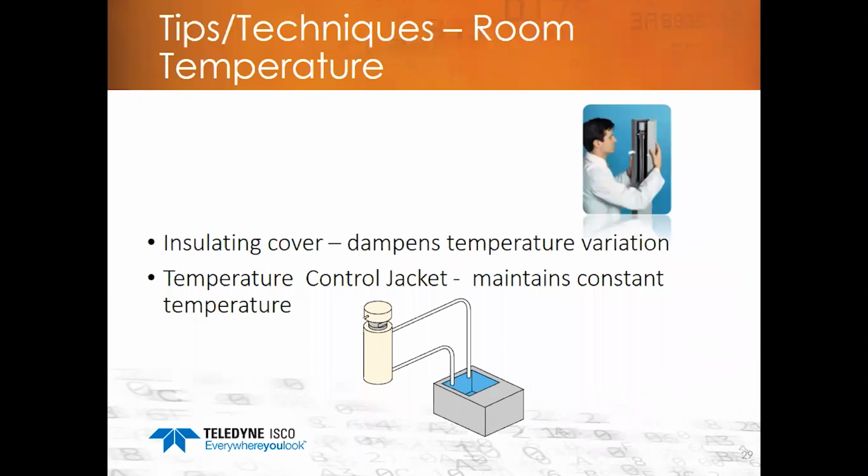Or also, we have a temperature control jacket. And this is really the best solution. A temperature control jacket will maintain a constant temperature around the cylinder, and it uses a water bath to maintain that temperature.